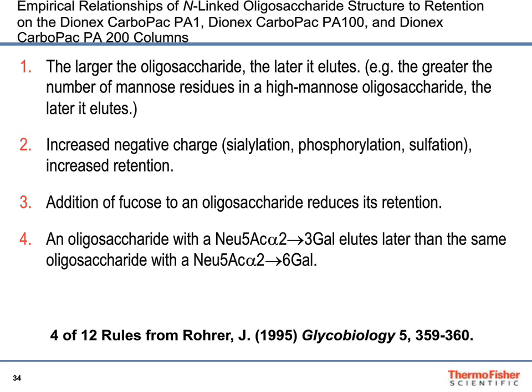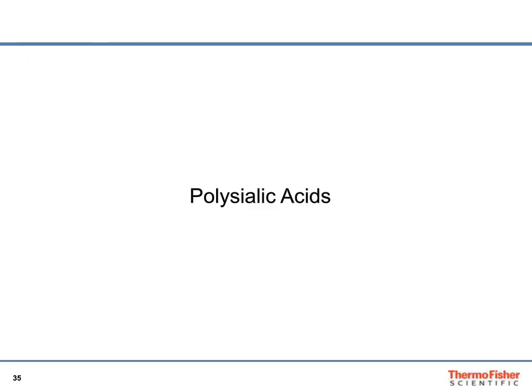So I've been talking about N-linked oligosaccharides. I mentioned O-linked oligosaccharides. We also separate those. I'll show you a little bit of data on that in a bit.